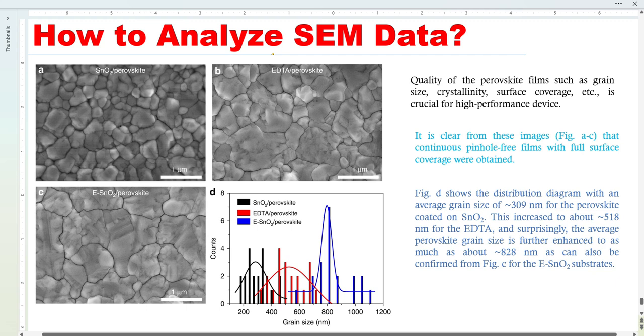How to analyze and describe scanning electron microscopy images in a research paper. SEM analysis is a very crucial technique and every top research paper must include these techniques because SEM gives us a lot of information about the surface morphology, the roughness, the grain size, and so many other information.